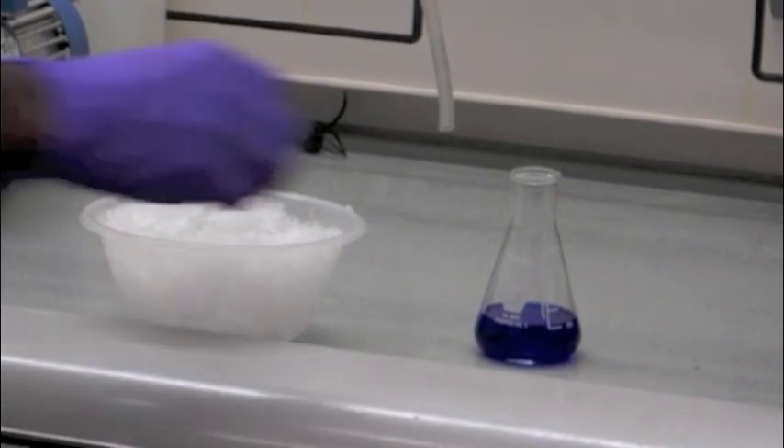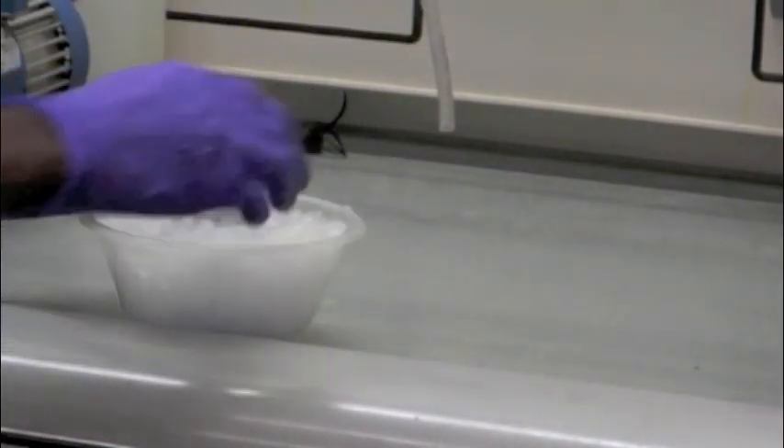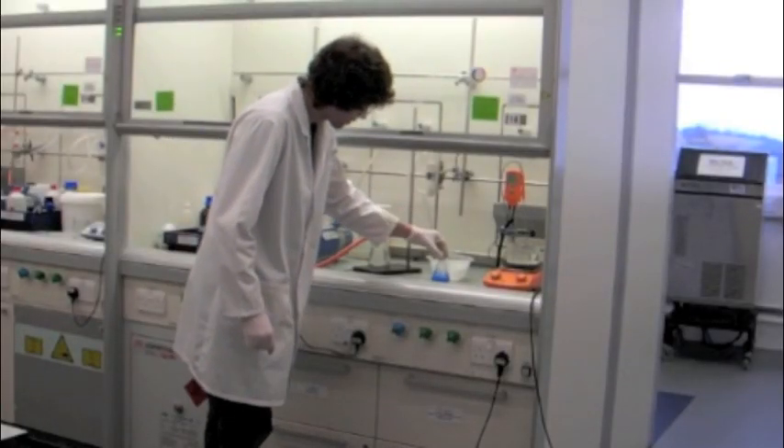It is then allowed to cool and placed in ice to crystallise. The product is then collected using suction filtration.